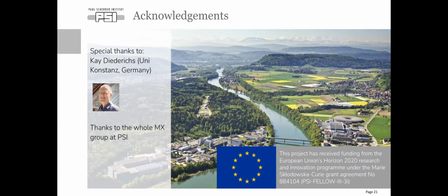Originally, it was designed that you would randomly divide the observations of every unique reflection. But in the meantime, there's a new method called the sigma tau method where we get rid of this randomness. If you really randomly divide all the observations for every reflection, you would have to calculate CC half several times and average, from my understanding. So we got this new way to calculate it. If you want to have a look, I can show you later. Thanks. You're welcome.